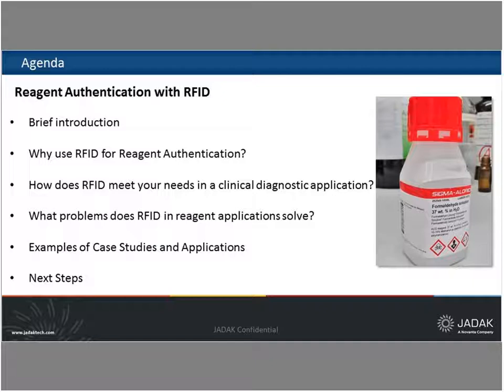Okay, very good. So what we're going to talk about today is reagent authentication with RFID. Just to go over the agenda briefly, we're going to start off with a brief introduction to JADAK as a company and what we can provide, as well as some basics on RFID itself. Then we're going to go into why you would want to use RFID for reagent authentication.